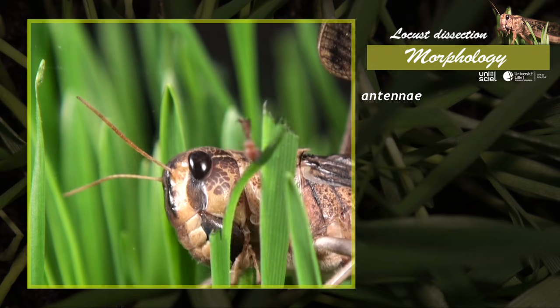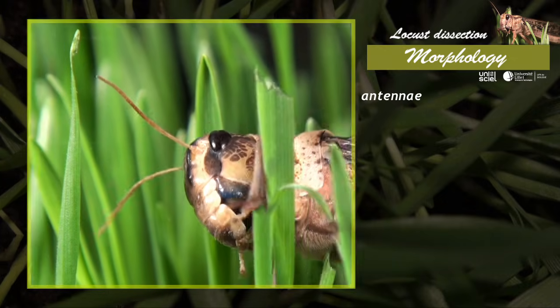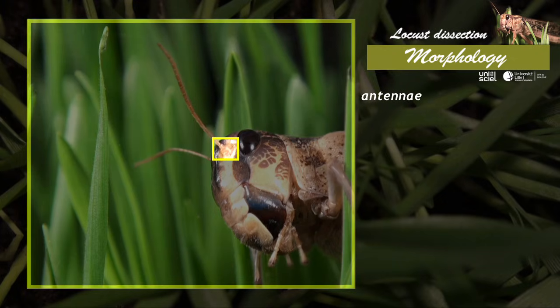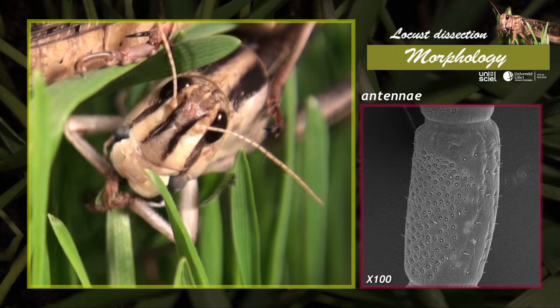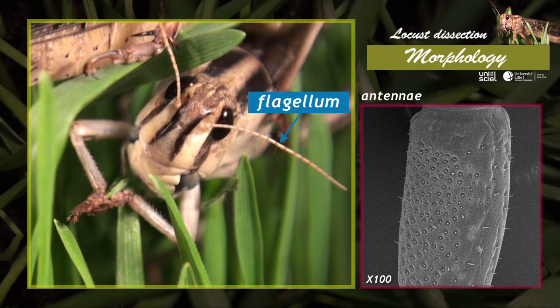The antennae are short and articulated. The first segment, the scape, articulates with the head. The antenna continues with a short second segment, the pedicel, and with a series of segments forming the flagellum.